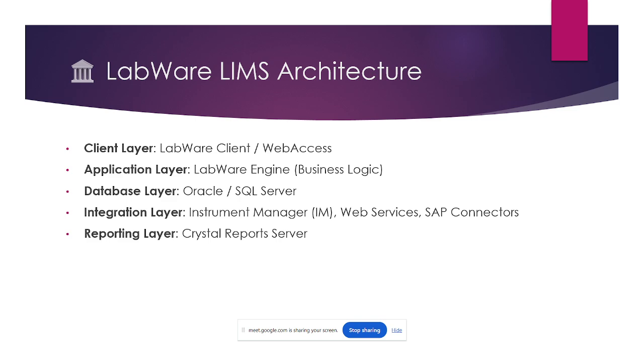Okay, so first was the client layer. What does the client layer mean? If you're seeing the LabWare client, sometimes the LabWare client will be given through Citrix, so we can call it a Citrix layer. We can use this application through the Citrix layer only.